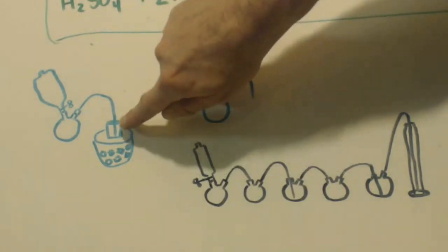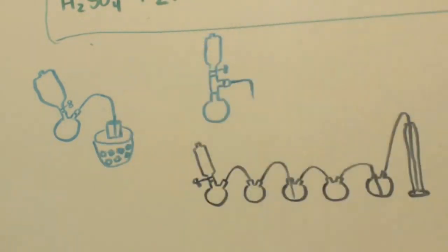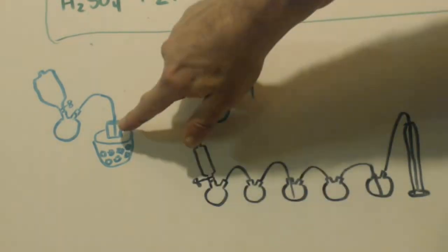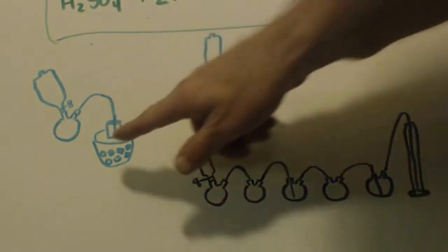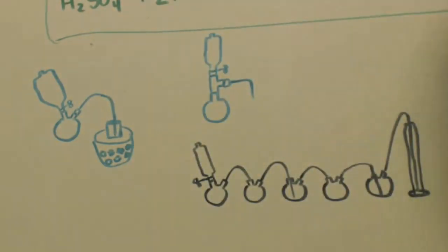See this cup of water? And there's an ice bath, so it's nice and cold. You know what I mean? The colder the water is, the more soluble the HCl is, right? And you can see the hose. You put the hose all the way down at the bottom, so it has time to go through all that liquid before it escapes. And it's that simple.